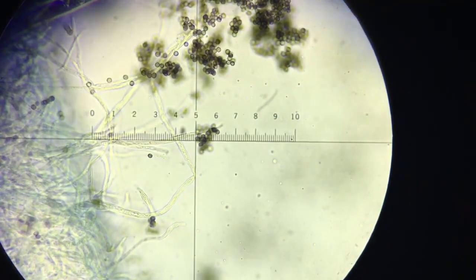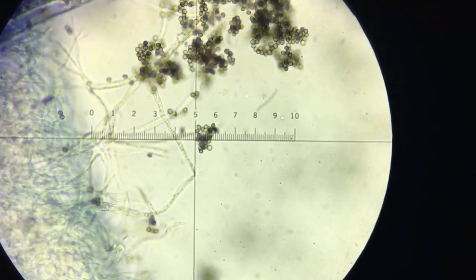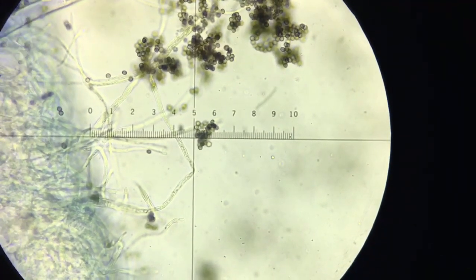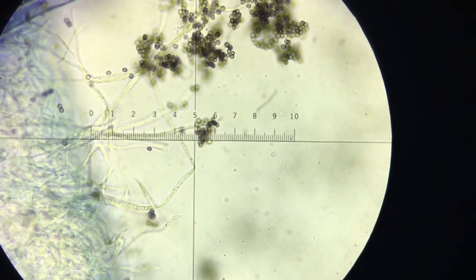All Aspergillus have septated hyphae, and I'm trying to point out a septation here, but I imagine the video quality may not show it very well.